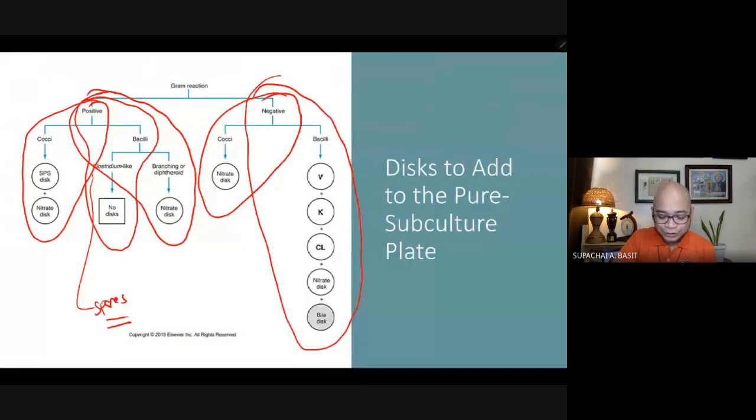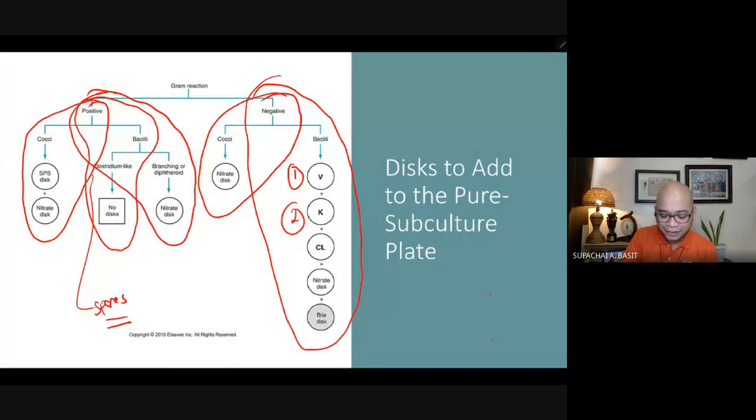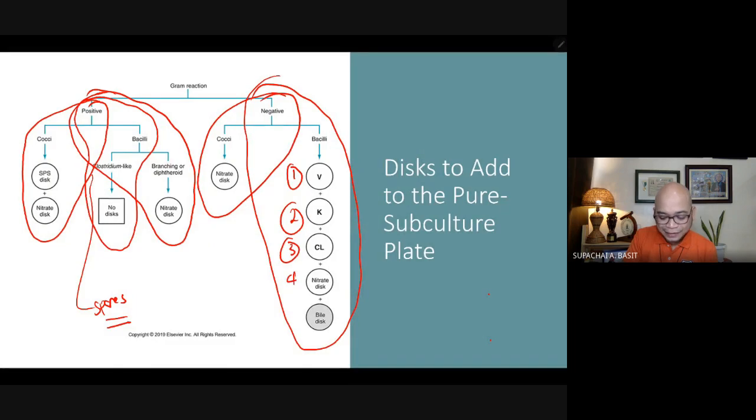Then we have to use the vancomycin disc, kanamycin disc, colistin disc, nitrate disc, and even the bile disc. Okay, so this would be useful for presumptive identification of anaerobic bacteria.